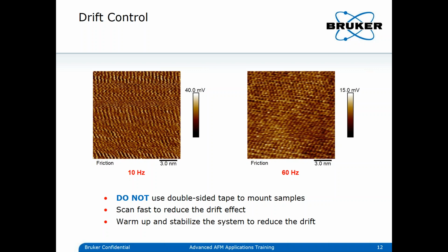One of the ideas we have, and which is nicely working, at least if you prepare your samples fresh, meaning also gluing your mica, for instance, on your steel plate, you shouldn't use double-sided tape for that, because double-sided tape takes a long time to settle, more or less. So we would recommend epoxy glue or something like that to glue your crystalline layer on the substrates.